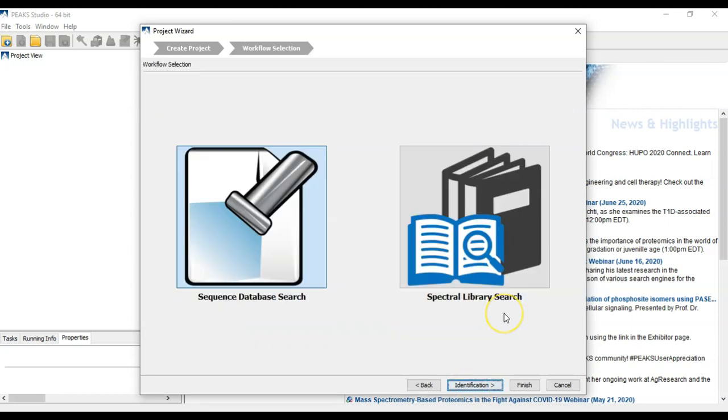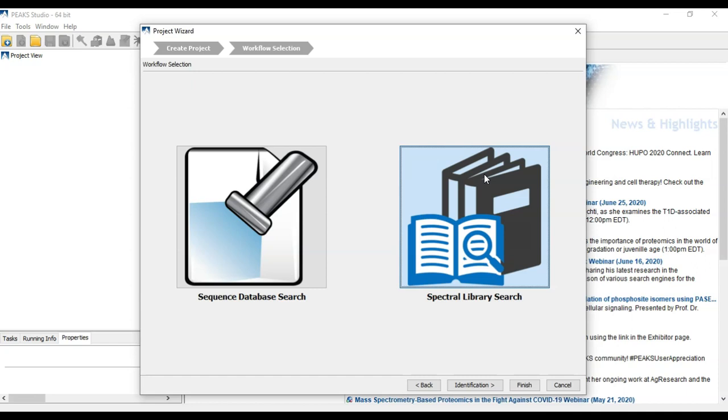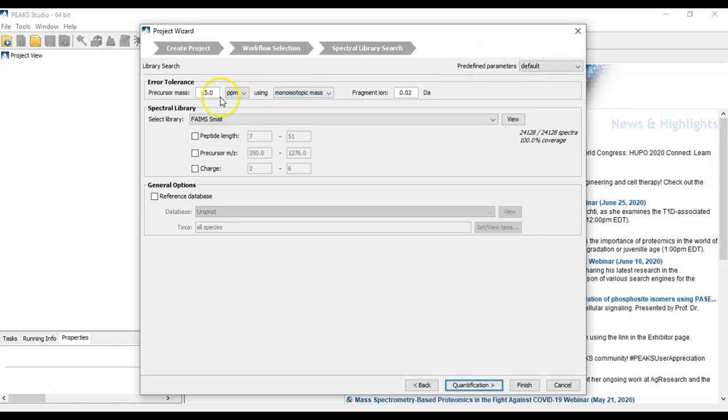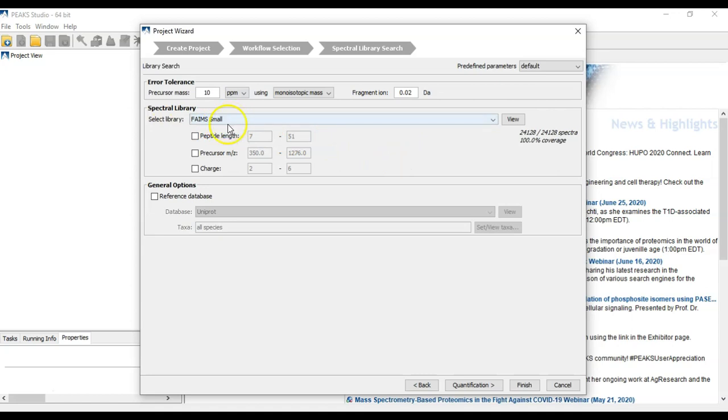Here you have two options. You can go here to the Spectral Library search to set up a library search with a library we set up previously. Then we can just set the parameters. Notice that we already have our library configured. Then we have some options here to specify length, mass, or charge ranges if we'd like.